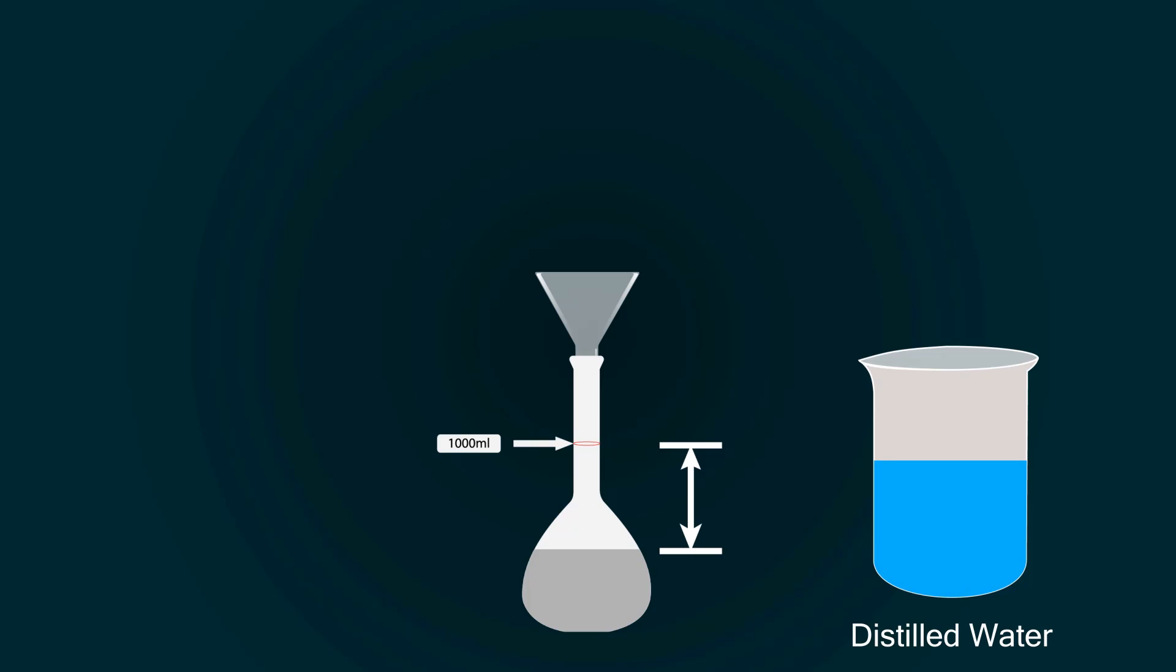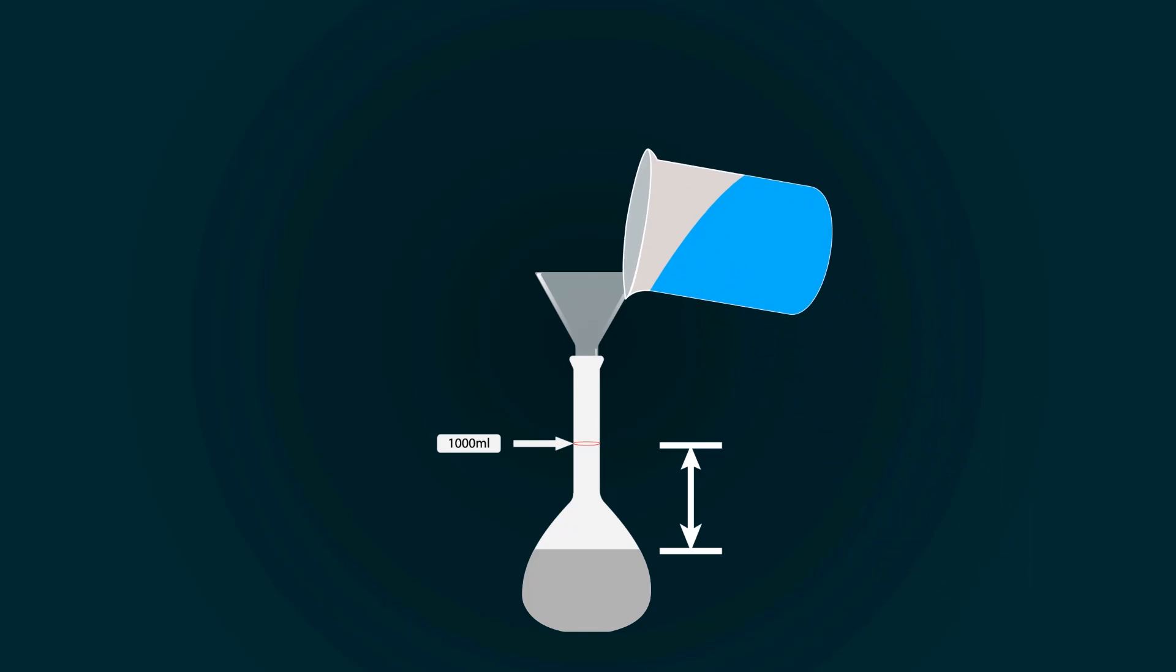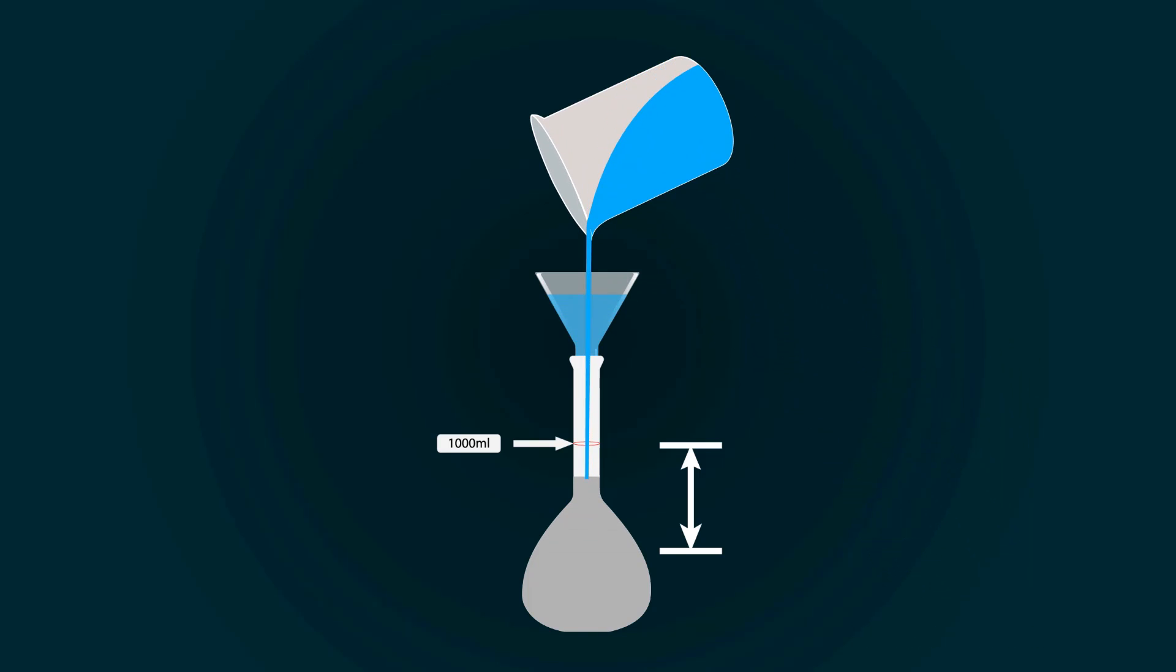So, take more distilled water into an empty beaker and start pouring it into the volumetric flask.